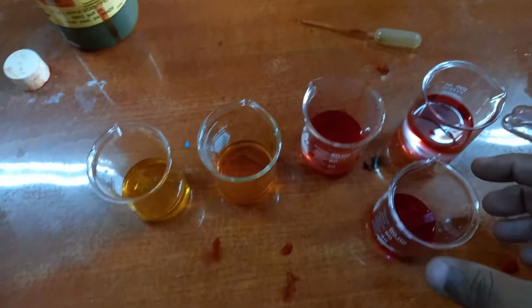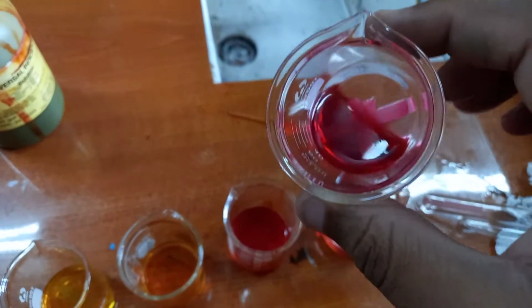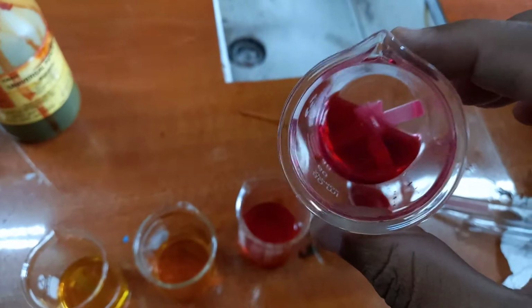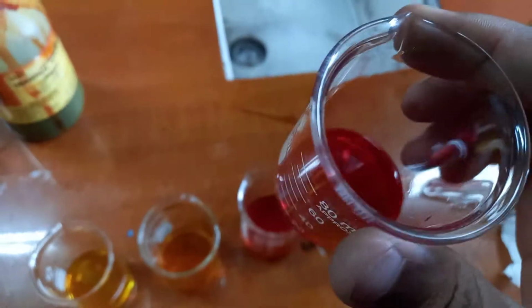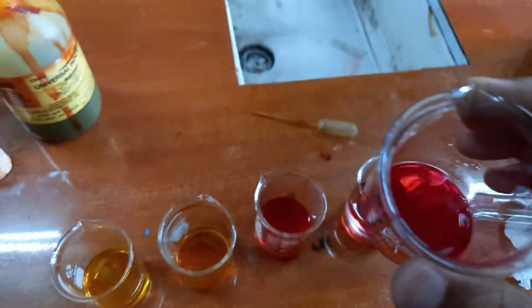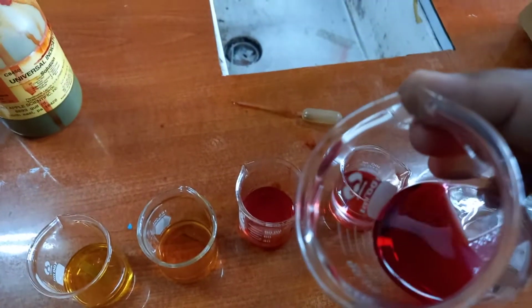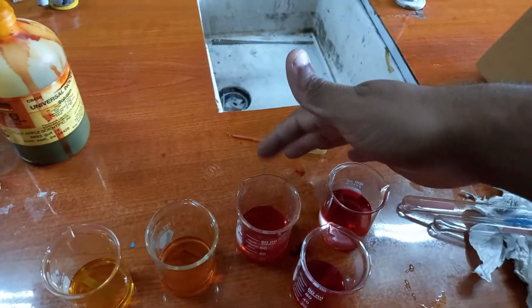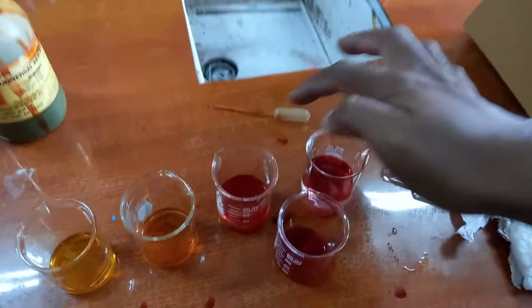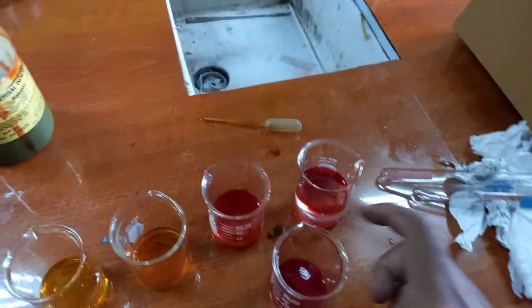Again, I did not pause it and did not play it back. So I added the universal indicator to the sample of aldehyde that we prepared. Well, it's now carboxylic acid, and that is what we're confirming. I added this universal indicator, and it is also red. So carboxylic acid and the aldehyde, these are definite aldehyde and carboxylic acid. This is the one we are confirming.